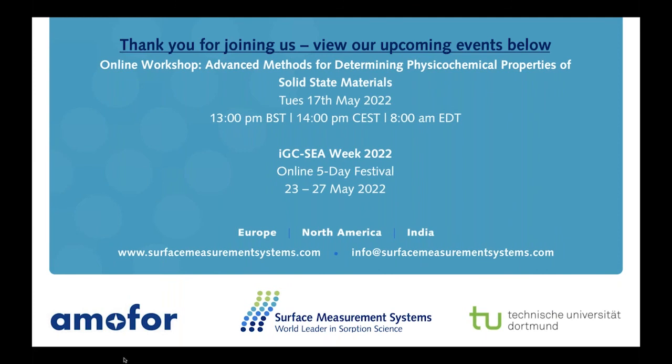Oh, so yeah, the scales you want to use for measuring your surface energy really just depend on the temperature that you're doing your experiments at. With the software we use to analyze our surface energies, we have a range of different methods that we can apply. The two most common ones we use are the Schultz method, the Dorris-Gray method, and a hybrid between the two, our polarization method.